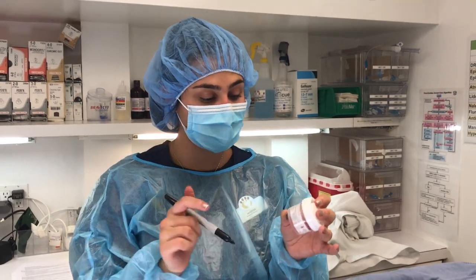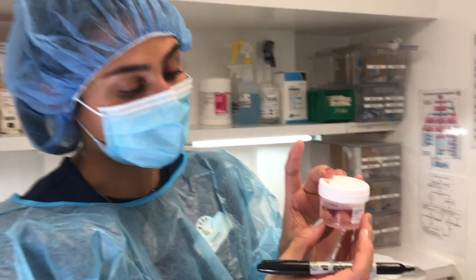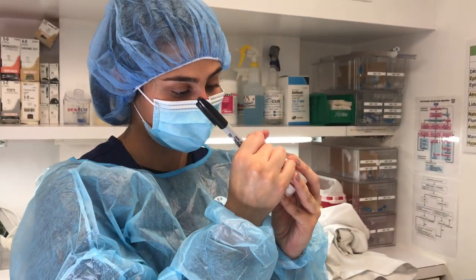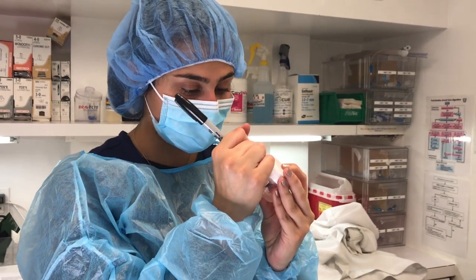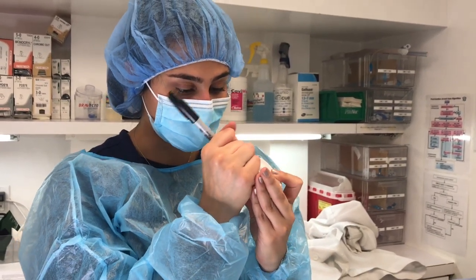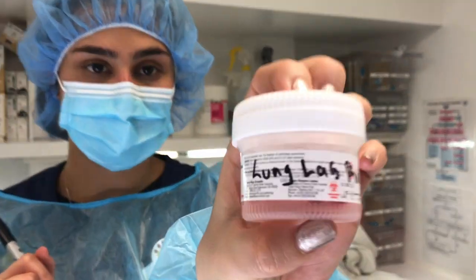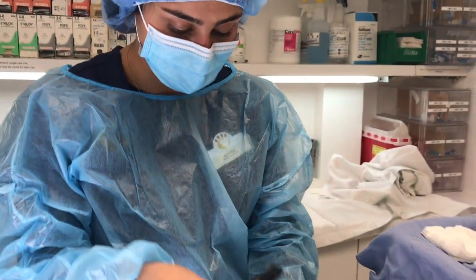Okay, now I'm just going to make sure that I record exactly what I did on here. So this was our sample of a lung. So I'm just going to write lung on here, and then write our lab rat and his patient ID number. Just like that. And I will do it for the spleen as well.